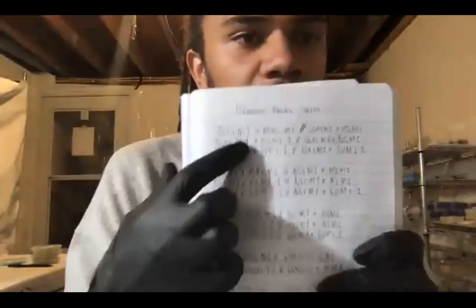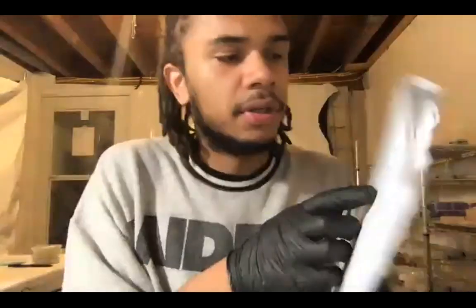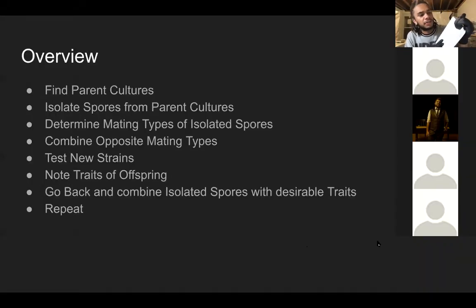I'll show you guys, or I write in my notebook, and you can see which one is bred with which one. After I fruit them, I'll go back and say, oh, hey, all of my strains that are bred out with KSM MAT2 have long stroma or dark colored stroma, and everything that's bred out with my MAT1 that I called Slay has high yields or something. You're going to notice different traits that are common with different parent isolates.